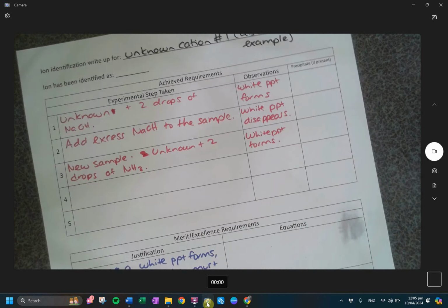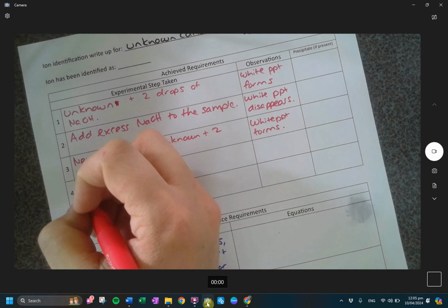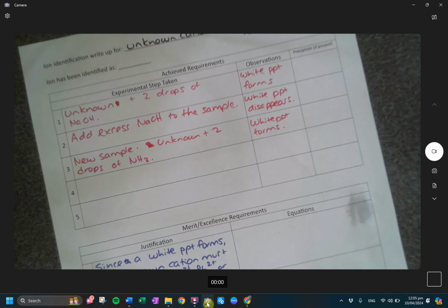In the 4th step, what did we do? We added excess. Bathroom? Yep. Let me get a note. What's the date?